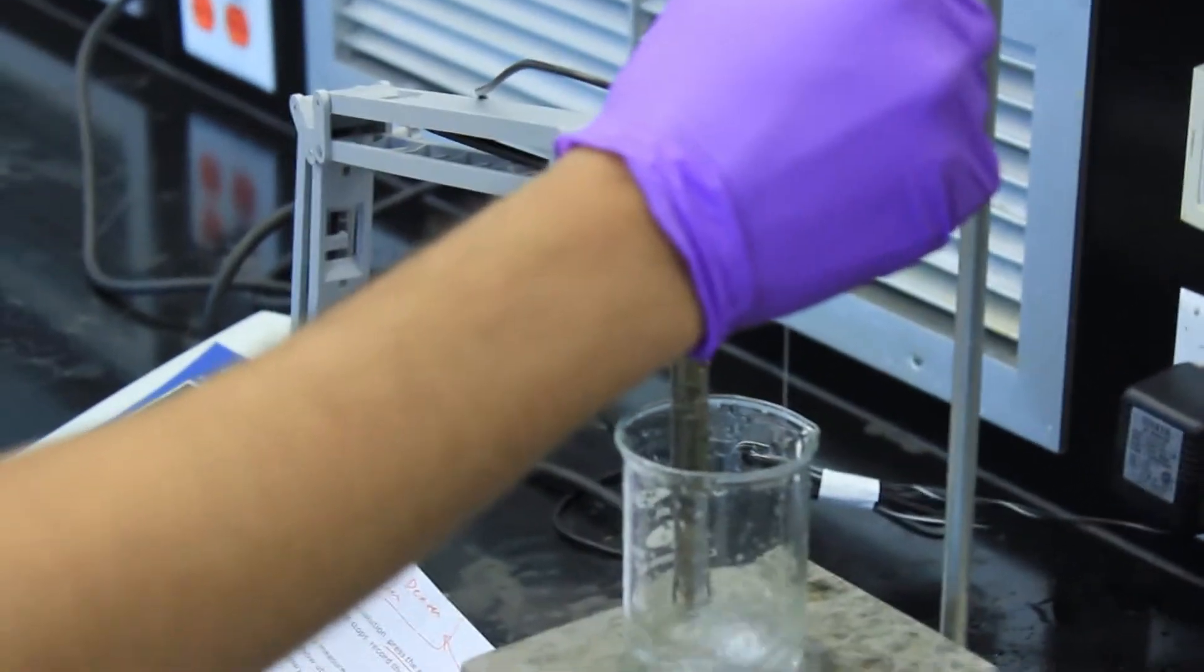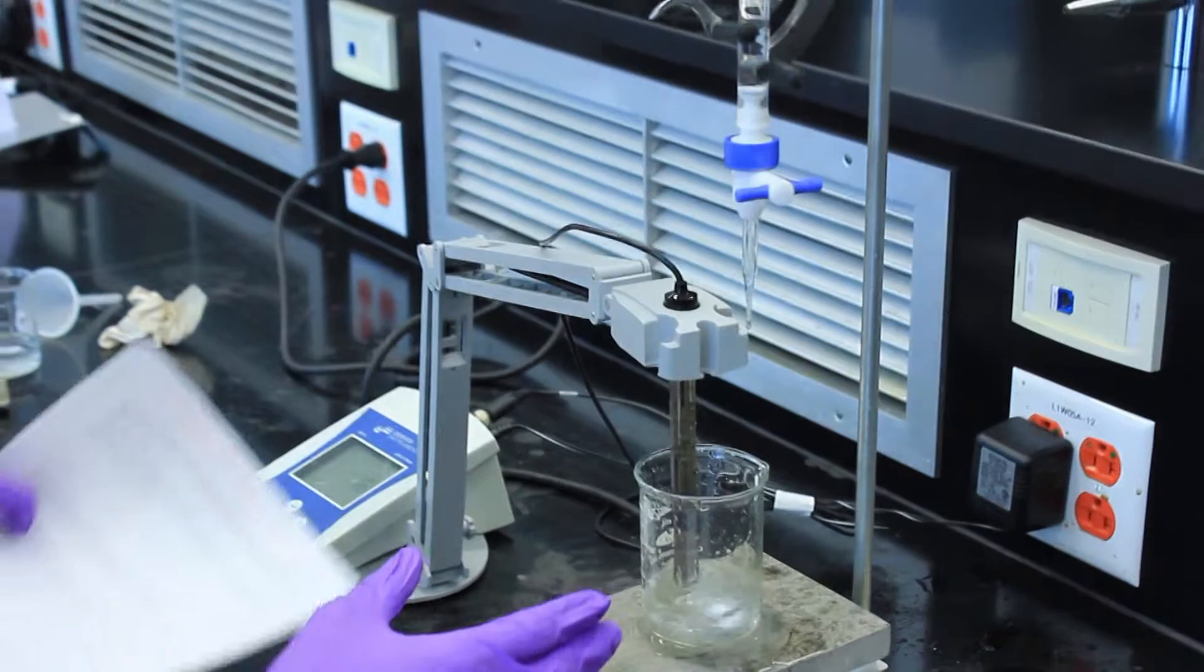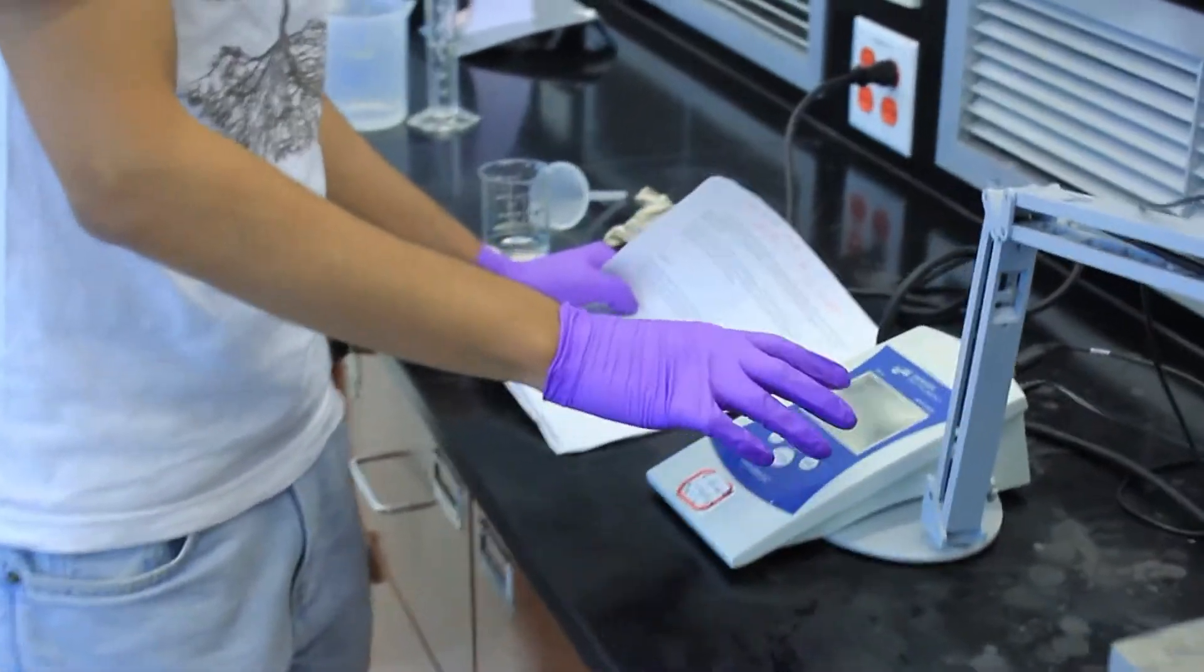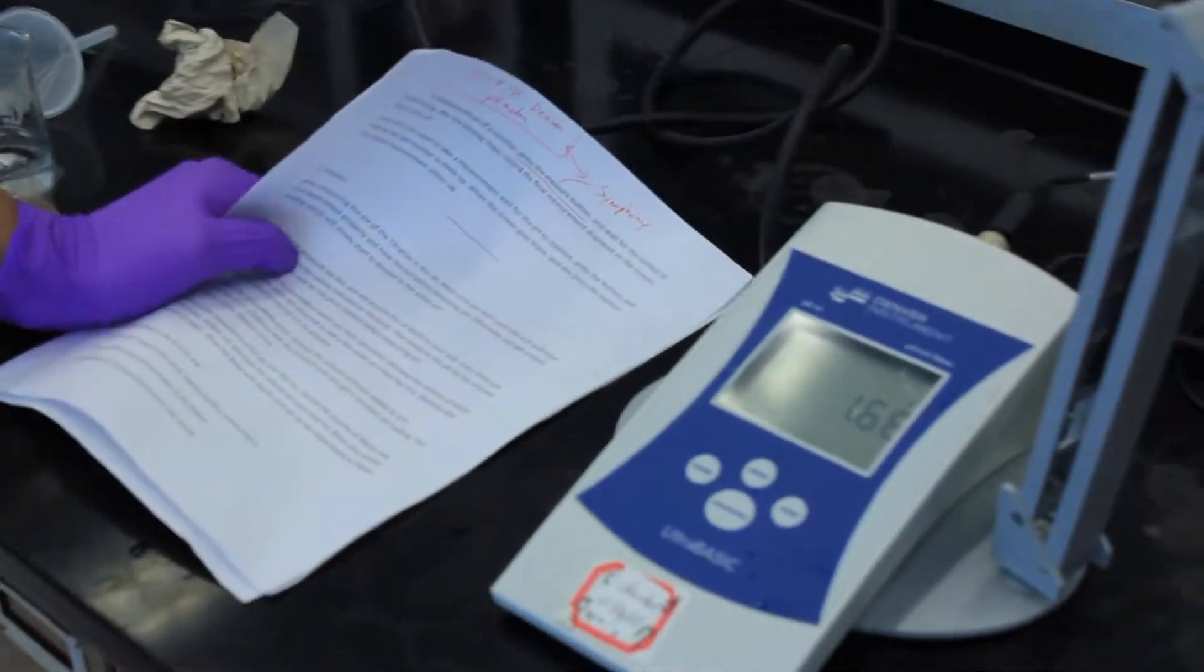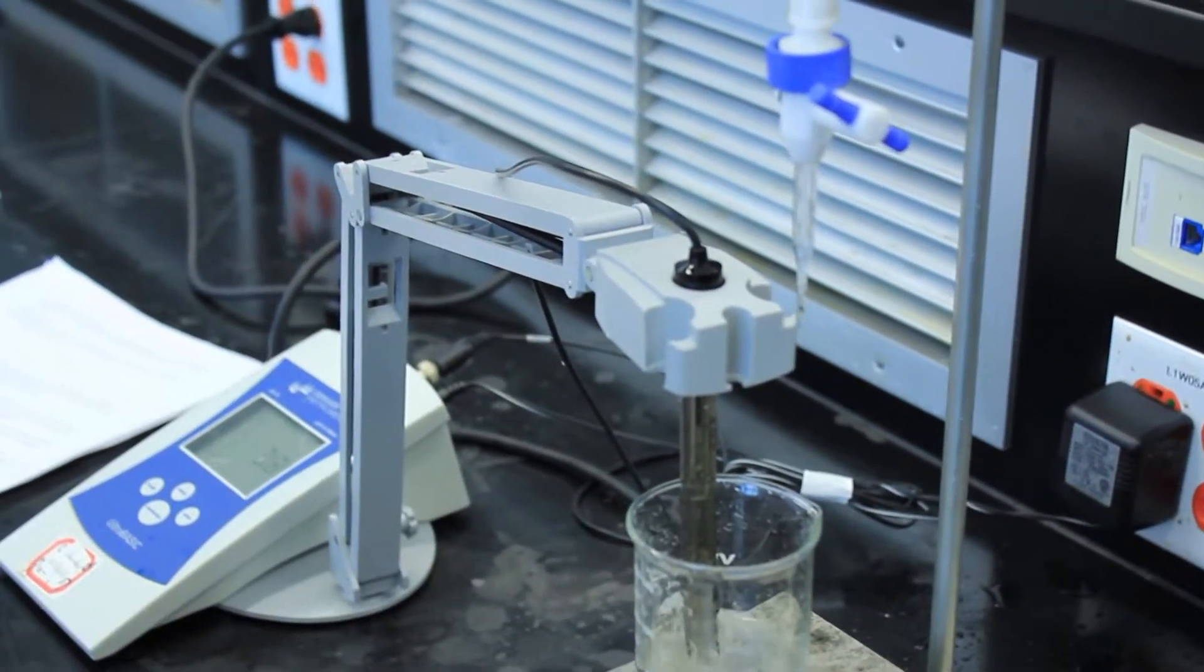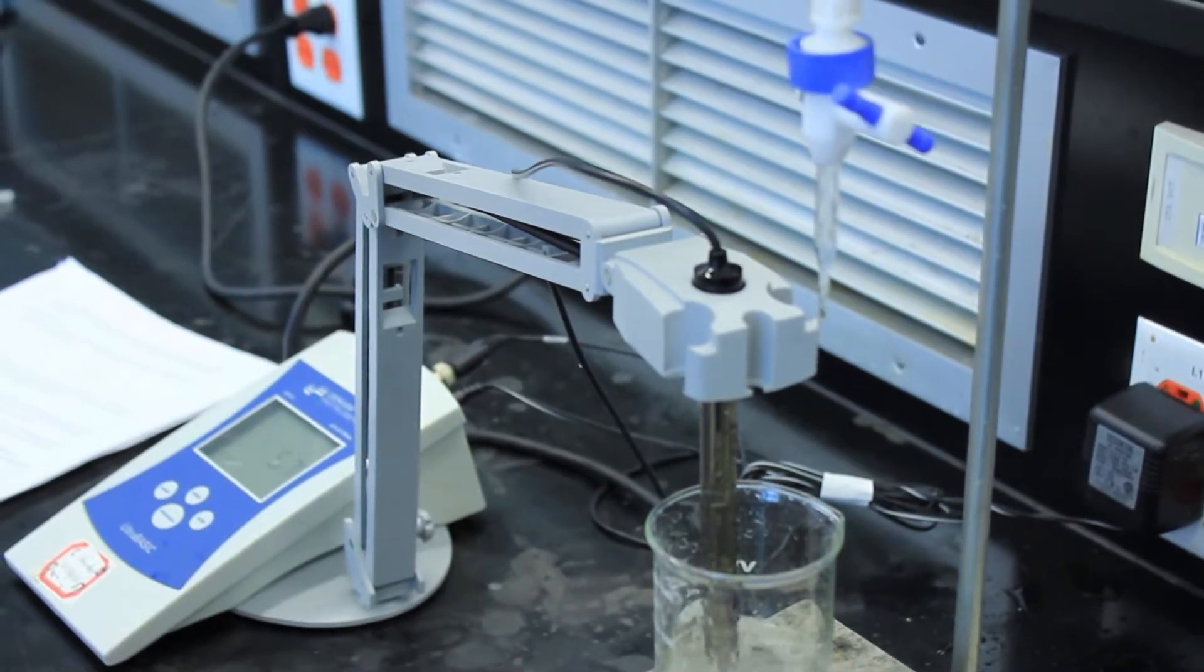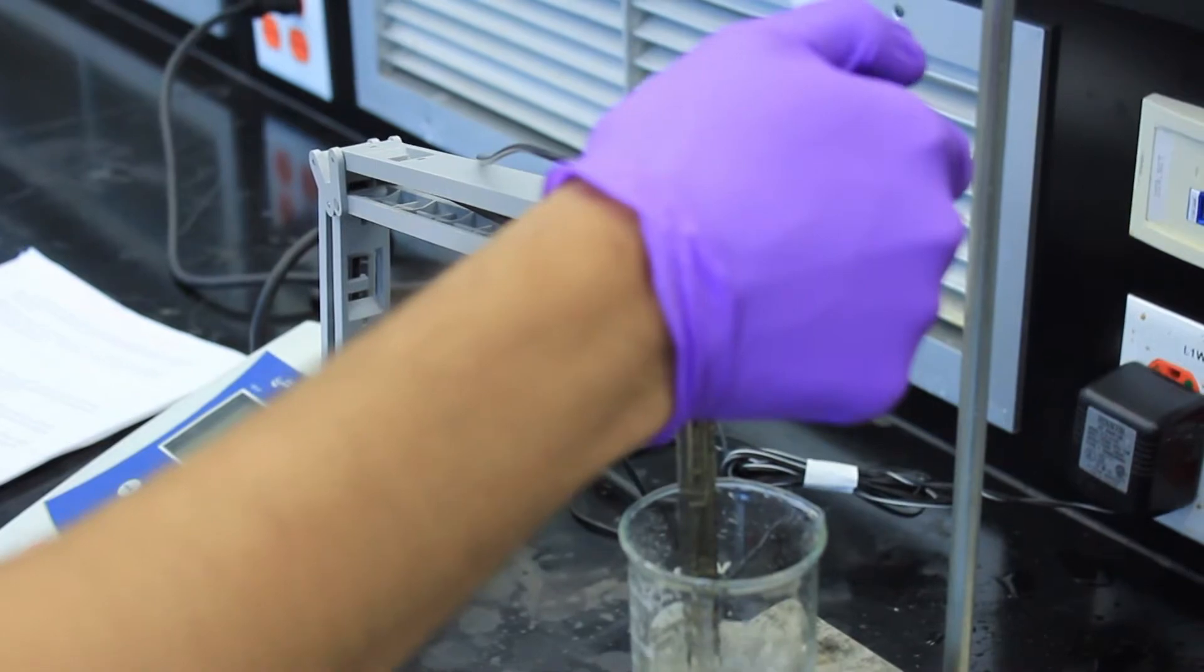Record the initial volume of the sodium hydroxide in your burette and then go ahead and start the titration. Add 2 milliliters at a time and wait for it to dissociate completely before you read your pH meter. You should have already calculated your equivalence point beforehand. Once you get close to it, in regards to your volume of sodium hydroxide, add only a few drops at a time.